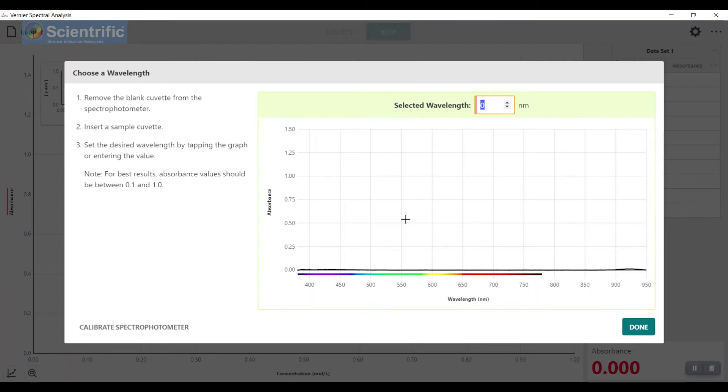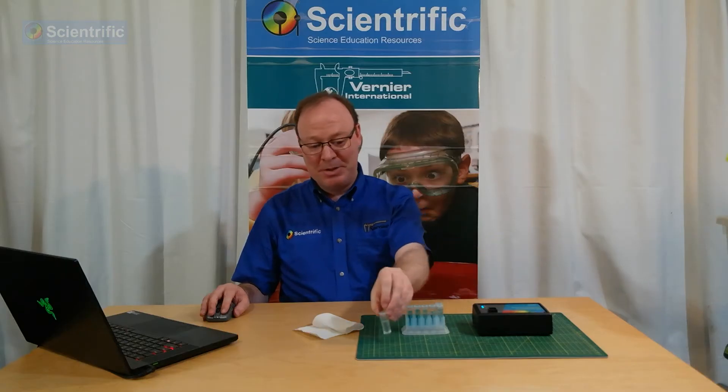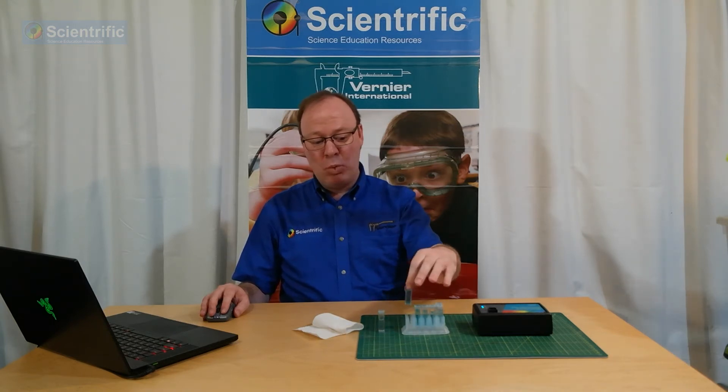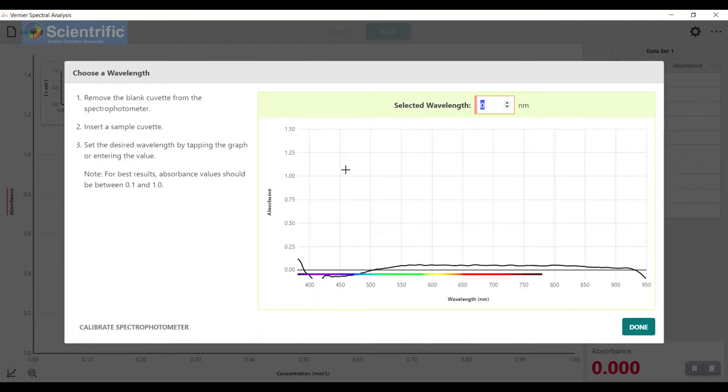Back on the screen, I'm going to remove the blank cuvette from the spectrophotometer and put it to the side. The next thing I'm going to do is take one of my standard solutions and pop it in. You can see on this graph, as I popped it in, that we have this beautiful peak here of maximum absorbance. I'm going to select that wavelength — 631 nanometers. For blue solutions, this works quite well. I'm now going to click Done.